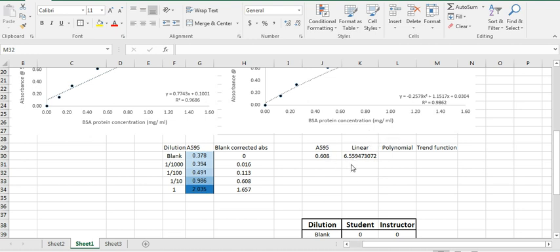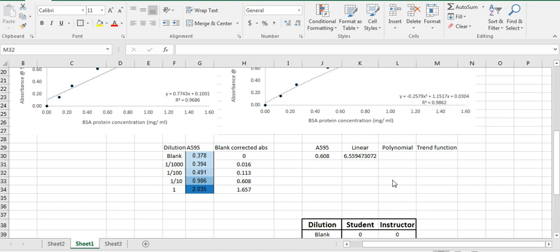So in addition to the linear trend line, you are using your polynomial trend line equation as well to solve for X, which is the concentration of protein.